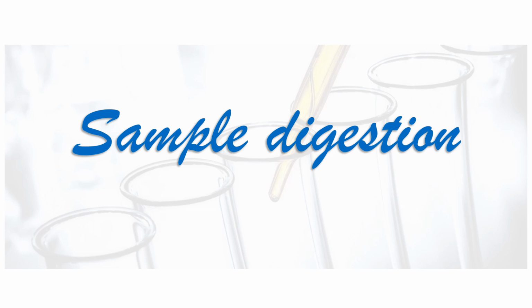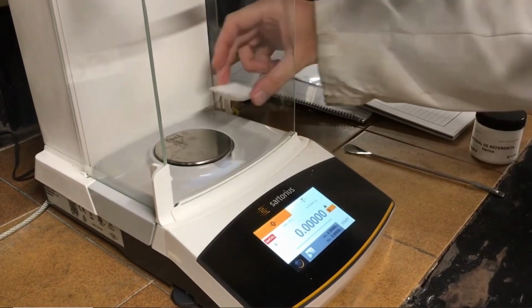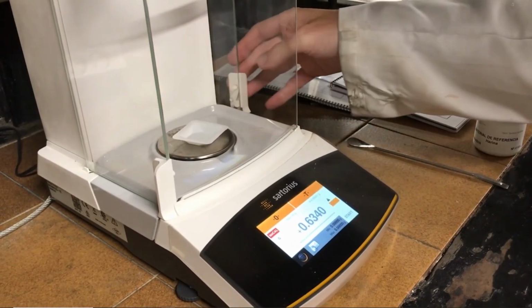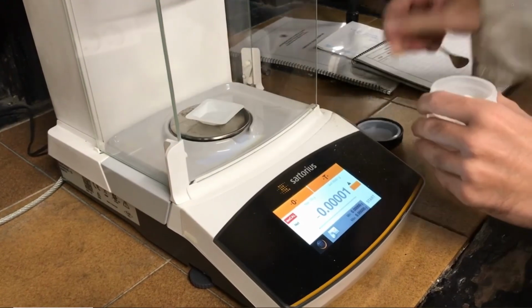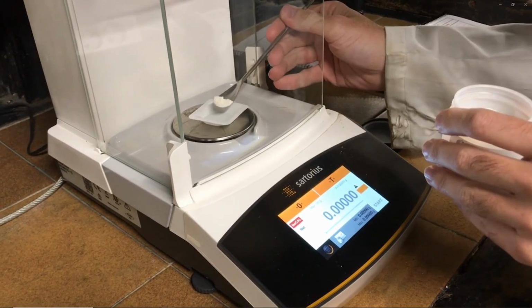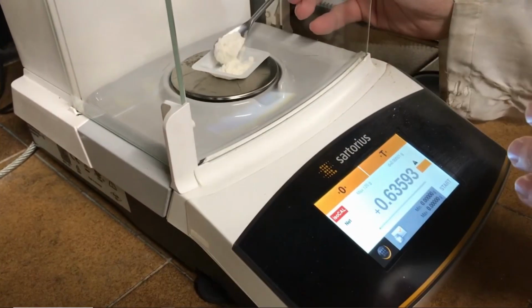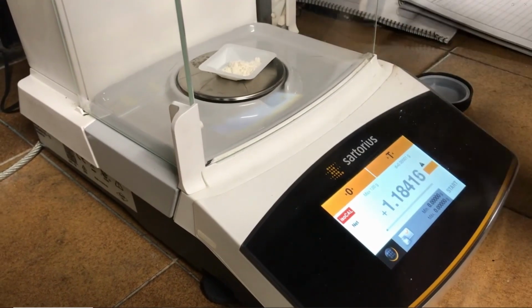Sample digestion. For the flour sample analysis, 1 gram of flour sample is approximately weighed with the help of a spatula using polystyrene weighing dishes and an analytical balance. A total of 6 sample replicates will be prepared by recording the exact weight of each of them.